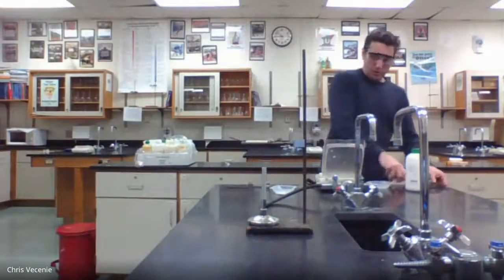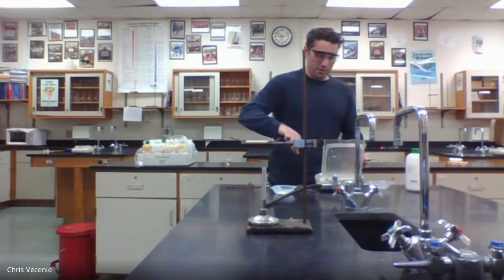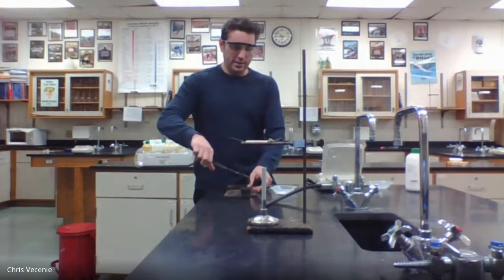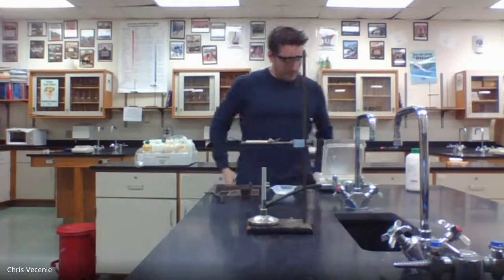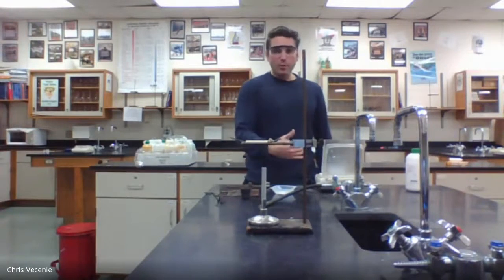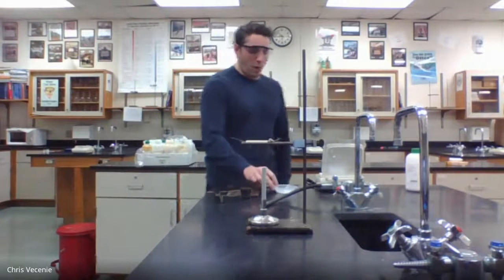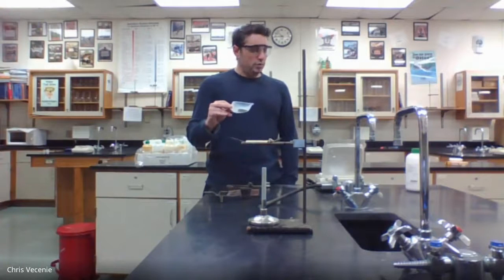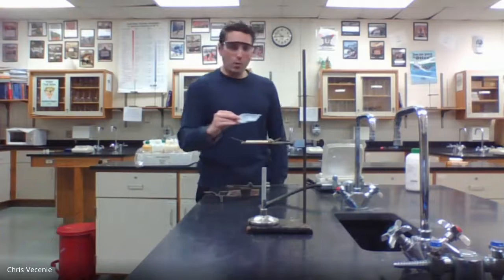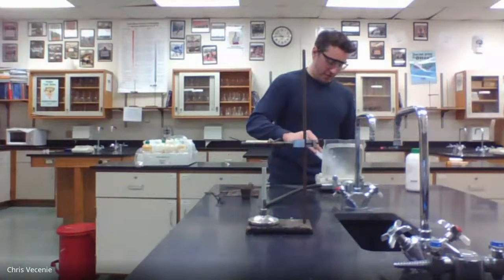I'm going to take my crucible off the balance. Right? And then I'm going to take an empty weighing dish and put that on there. And then I'm going to zero that out. I'm going to hit zero, and that tells the balance to remove the weight of the dish from it. And I'm going to add enough white solid into this, right, to get between 1.90 and 2.10. And honestly, even if it was outside that range, it wouldn't make a big deal. But I'm going to go ahead and transfer that.